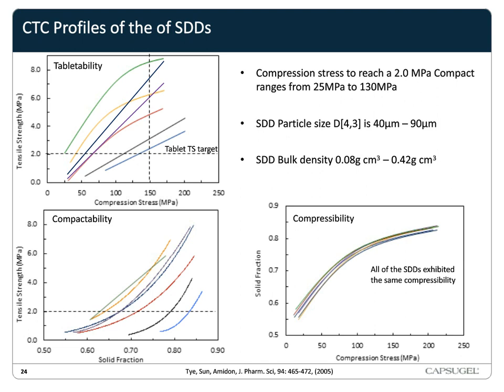Tabletability, which is the graph in the upper left, describes the ability of a compact to gain mechanical strength from bonding caused by the application of force. And finally, compactability is the intersection of these two. That is, it's the mechanical strength of a compact for a given porosity.